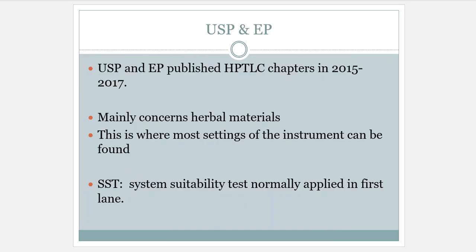All right, so a little bit of summary here before we end this video. The United States Pharmacopoeia and European Pharmacopoeia publish chapters that give instructions on how to run HPTLC. For the first time, they actually started including this method, and because of that, this method is going to become more and more popular over the years. This began in 2015 to 2017.